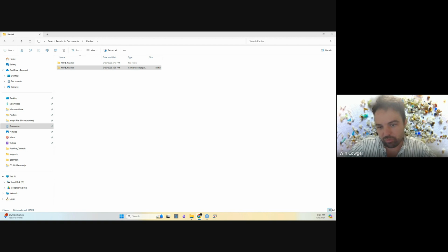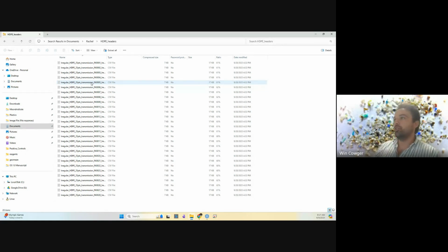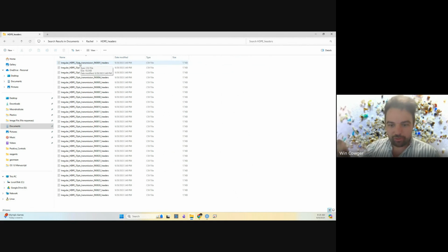If anybody has trouble accessing this file, what I've shared is a zip folder full of HDPE spectra that was shared by my colleague Rachel Kozlowski for doing this analysis. While y'all are downloading that zip folder, I just want to walk you through why this data set. Why am I analyzing this data set using batch analysis?